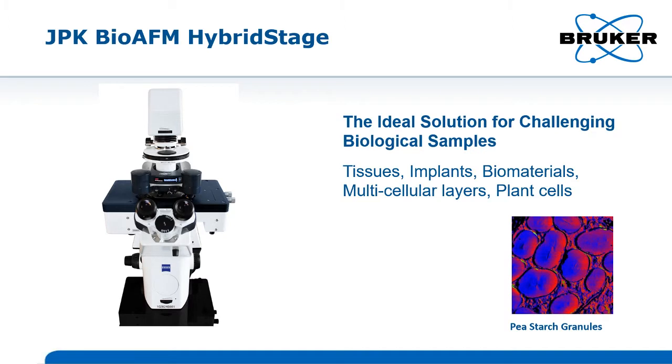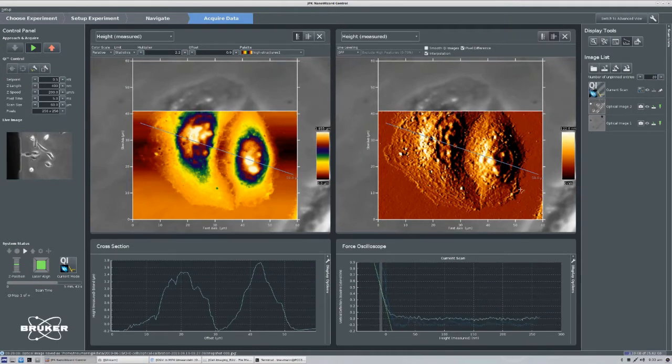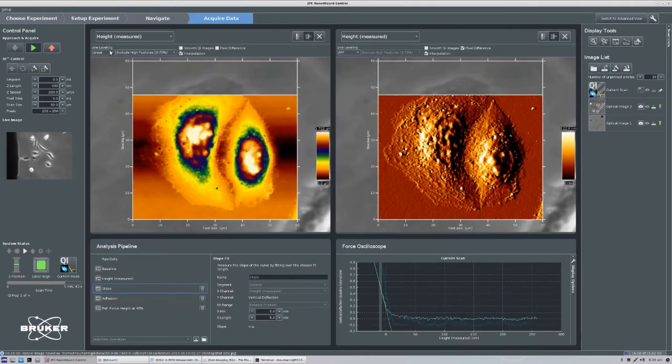The hybrid stage is the ideal tool for users of atomic force microscopy who work with soft and sticky biological samples or tissues in thicker multicellular layers, which typically have structured, uneven surfaces and large variations in their topography.